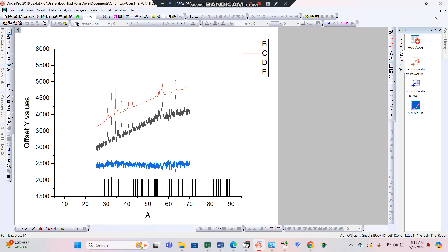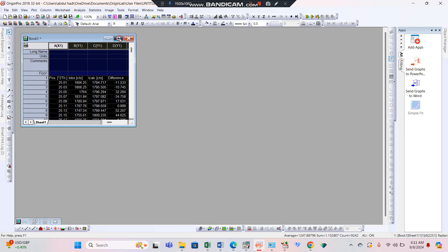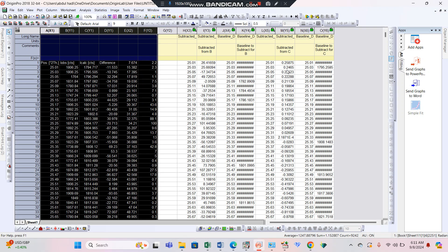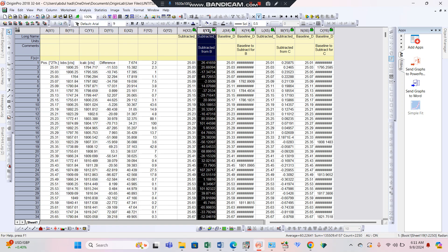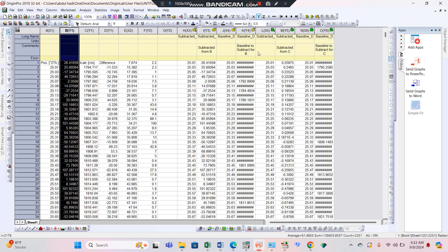Minimize this and come back to the data table. Here you can see two fitted datasets have been obtained. This is the subtracted data of the first line — I-observed — and we will need this baseline-fitted subtracted data instead of the original I-observed B-Y1. Copy this data with Ctrl+C and paste it into column B-Y1 with Ctrl+V.